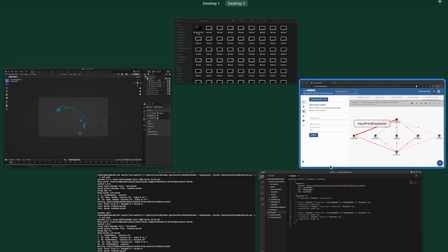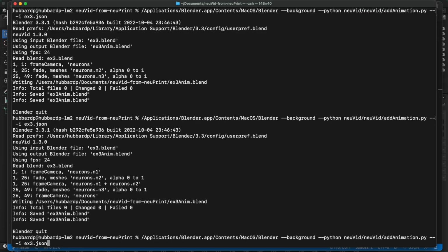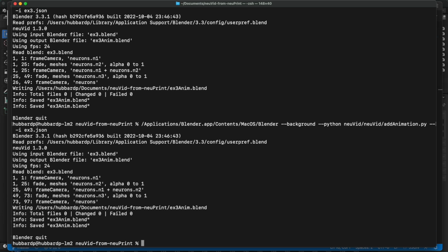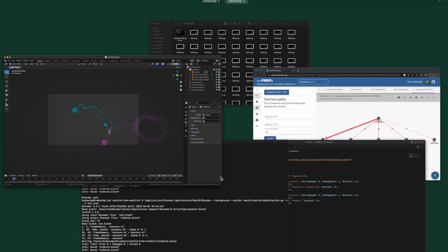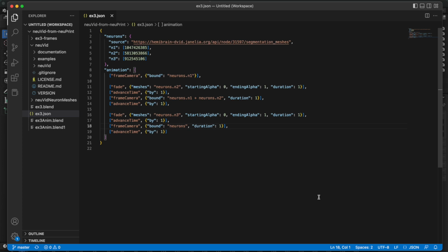Take a look at how that looks. So fade, frame, fade, frame, fade, frame. Well, that's interesting, but on the whole, I don't think I like it as much. So I'm going to take it out. Go back, undo, undo.